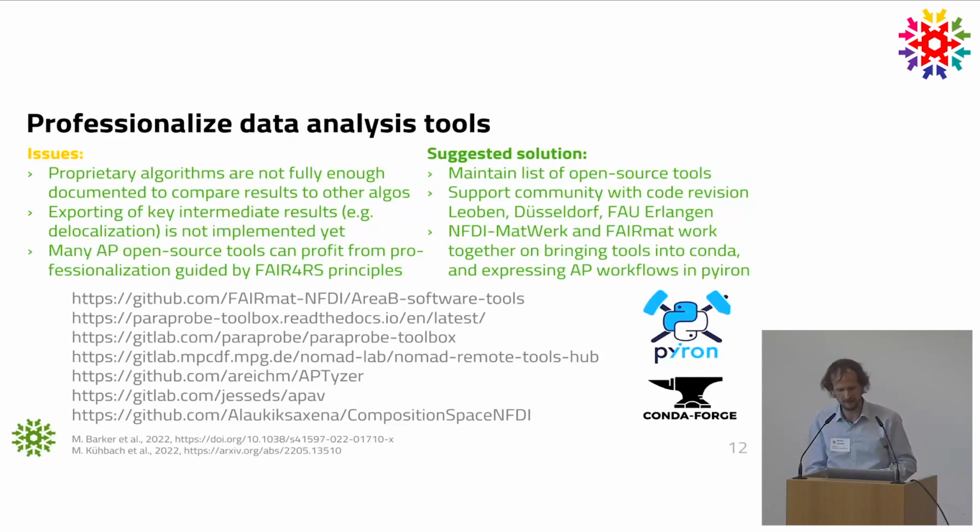But what we can now do with that is, when we run a computer simulation and post-processing chain, let's say you take the atom probe data set, you reconstruct an interface, you then get the composition profile across that interface. These codes, at least one code, and we would like to get this working for more and more codes, starting with the people in Düsseldorf, who I think will be a little bit quicker on picking this up. The point is, I would like to get to a state where I don't have to ask myself, okay, what have I done five years ago? Which settings have I used? Because it is so difficult, in particular with parameterized methods, to keep in your brain and mind what you have done.